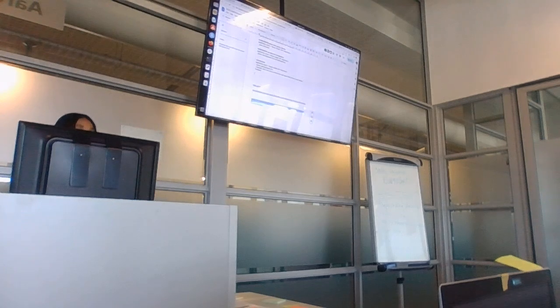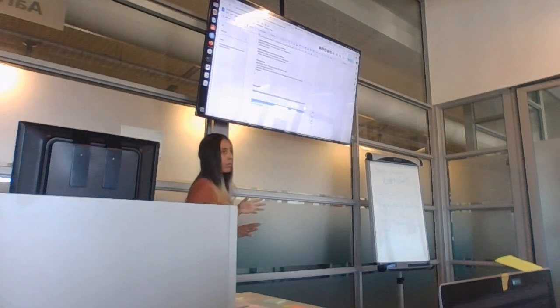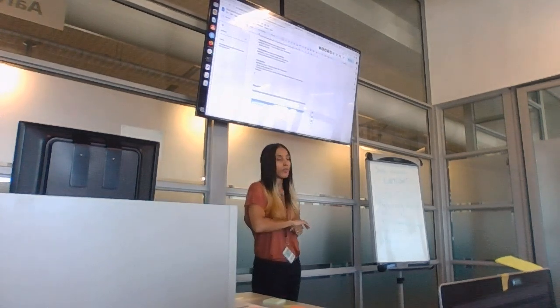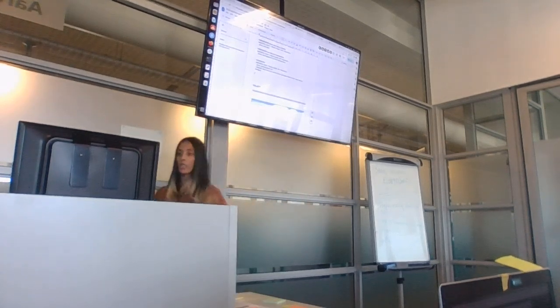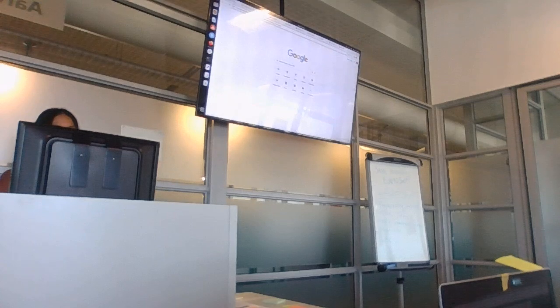So you can either look for the file or copy it again and put it in your URL and then download it to your downloads or something. So where do you paste the file again? You just paste it anywhere in a new tab, just paste it into your URL. Click enter so that it can download to your computer.